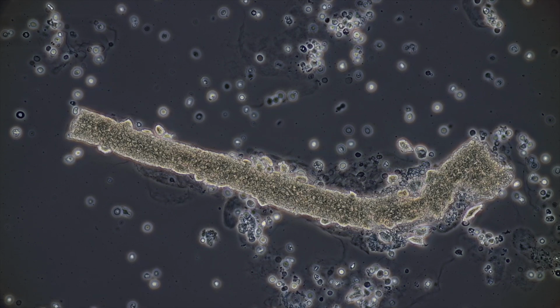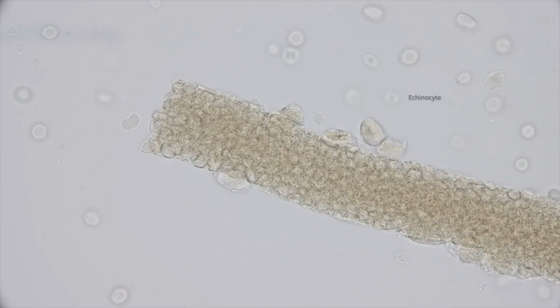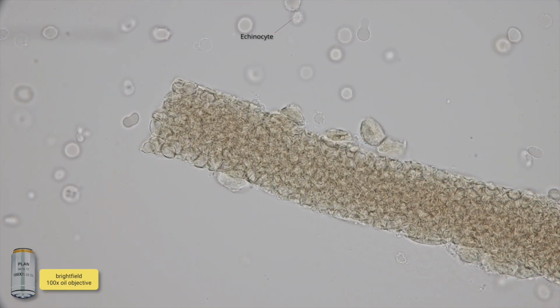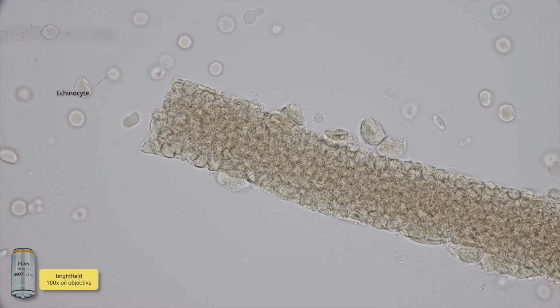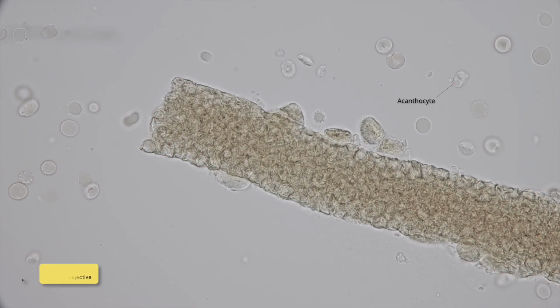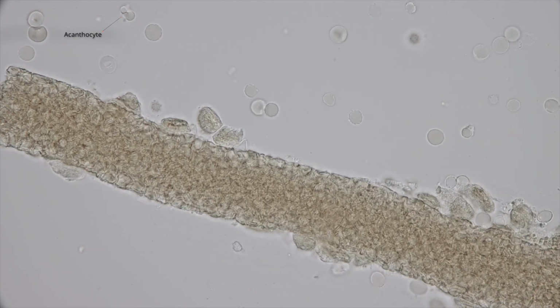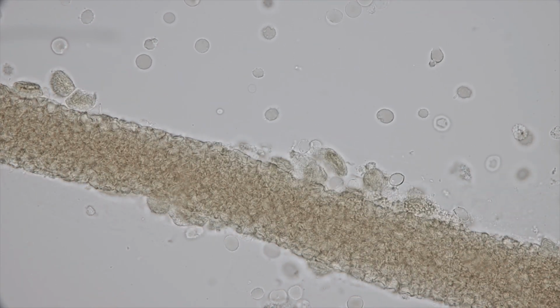This cast appears to be degenerating. We can see the outline of the red cells, but within the interior of the cast it looks more like pigmented granular material. Here on the 100x oil objective we get a much better view. We'll see an echinocyte or crenated red blood cell floating by there. Focusing up and down, you can clearly make out the outline of red blood cells on the periphery of this cast. And again, it looks like the interior of the cast is more of a pigmented granular material from breakdown. So this cast is in the process of degenerating into a hemoglobin cast or a pigmented granular cast.